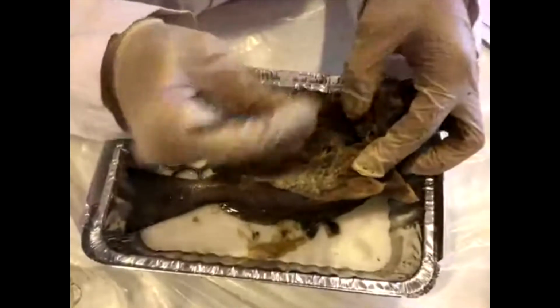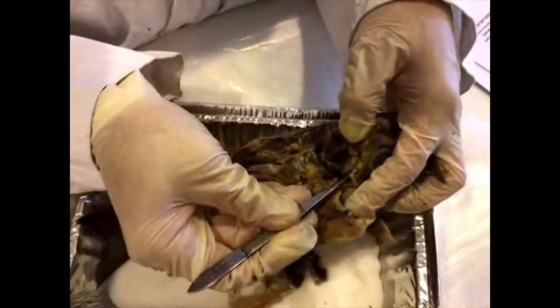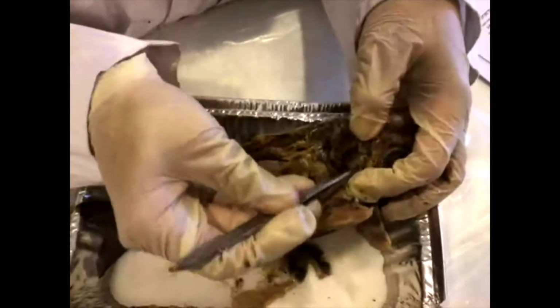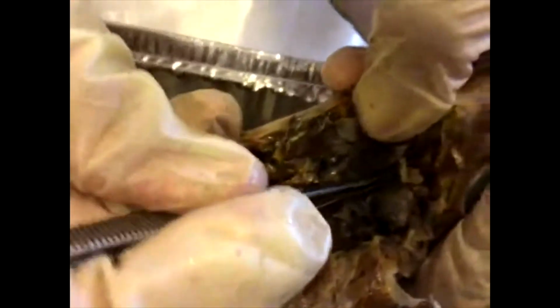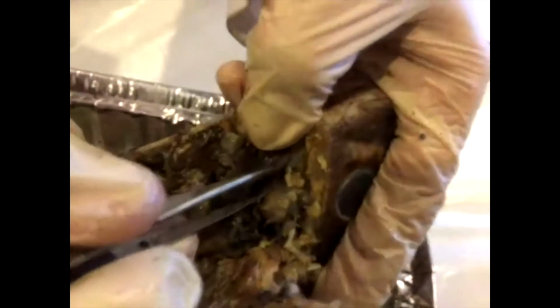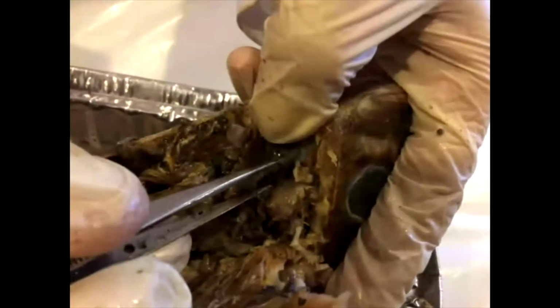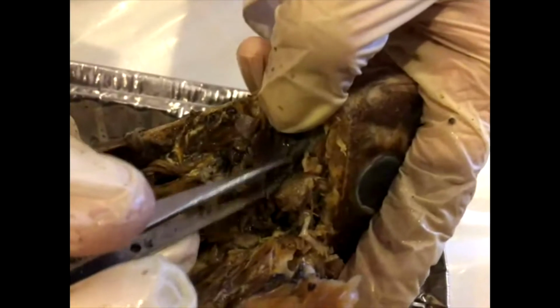I don't think we're going to get it out. But maybe what you'll be able to see is right here. There's kind of a lobe. Can you see that? Right by my finger. The heart's right in here. And this darker lobe, I would believe, hold on a second, I'm going to have to double check on this. So it has two lobes.